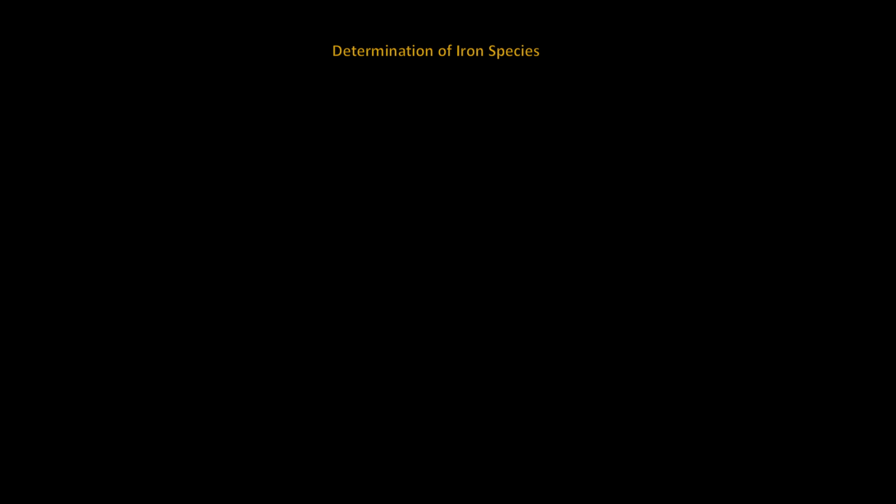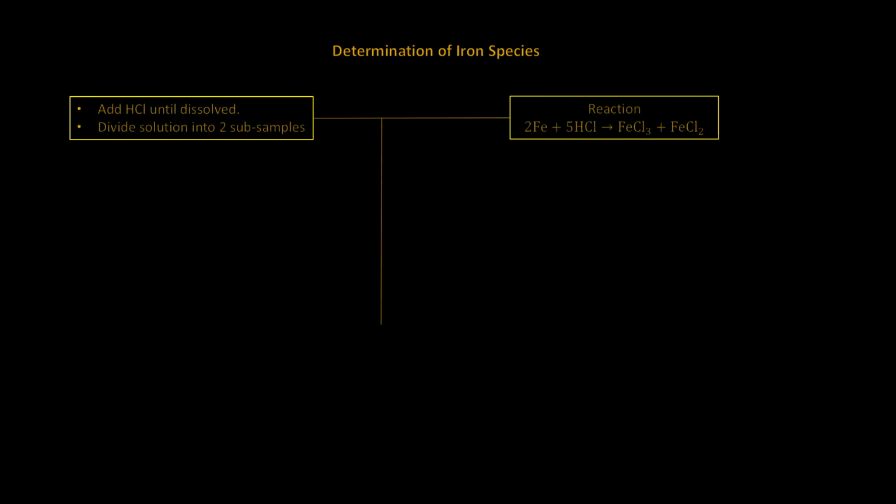As I mentioned in the group separation, being part 3 of this series, I'd like to take 5 kilograms of sample, homogenize it, and quarter the sample, leaving some for future use. Out of the 2.5 kilos, a small amount is removed for iron determination. The process is as follows and is quite simple.